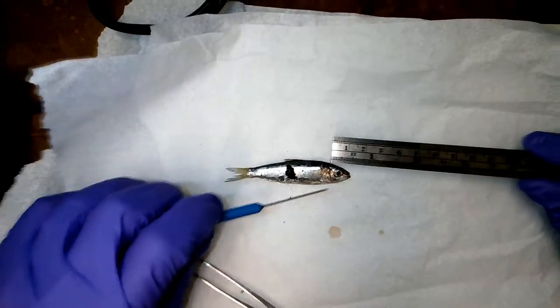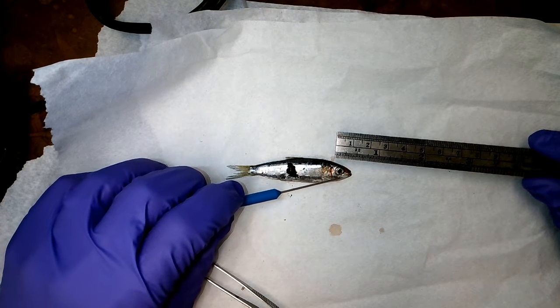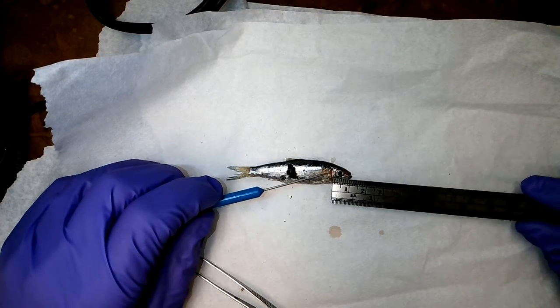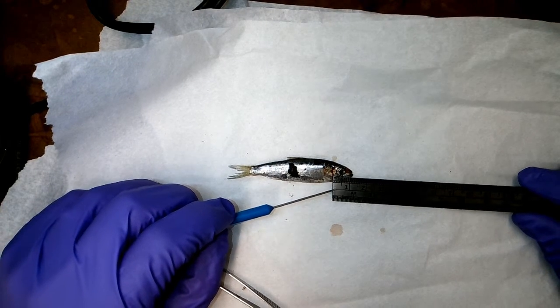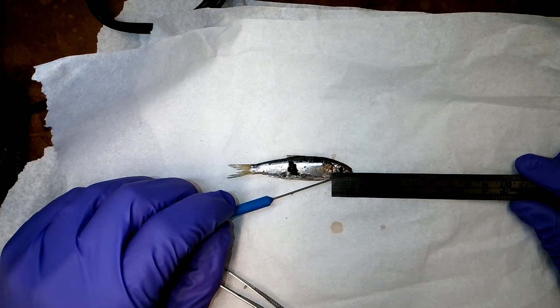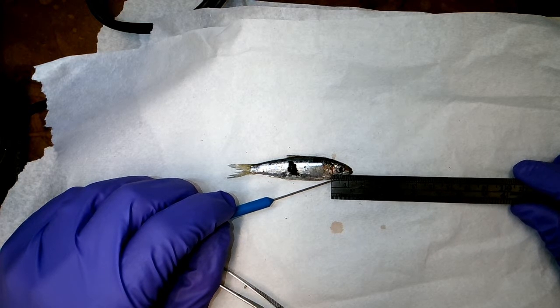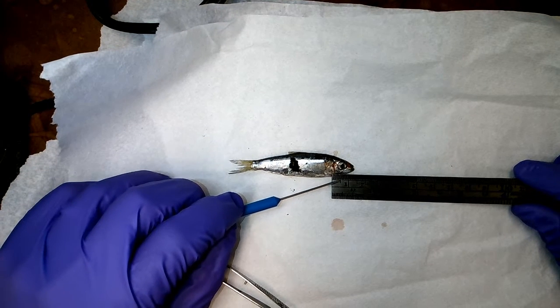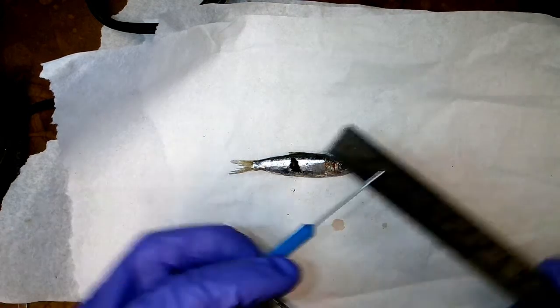I'm going to start my measurement here and end it here. It's about 5 millimeters. This is 10, this is 5, these are individual tick marks. So I'm going to say 5 millimeters for a width.